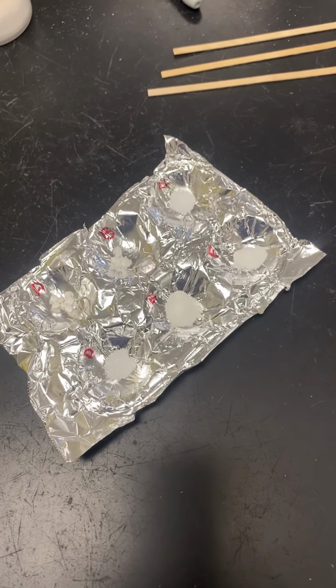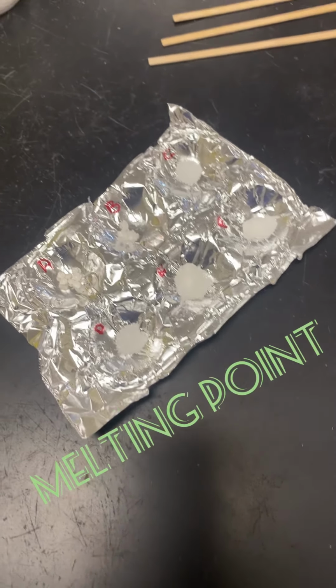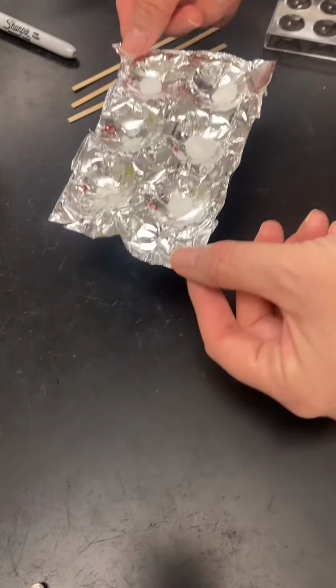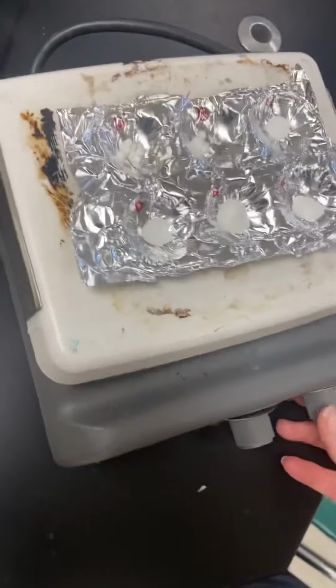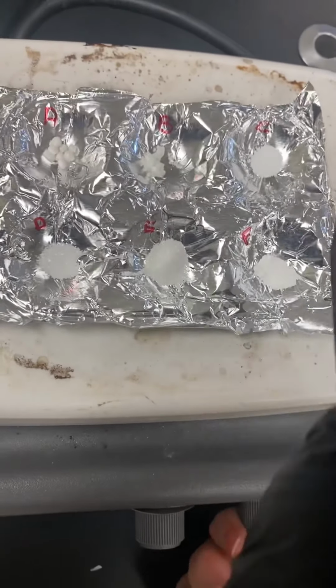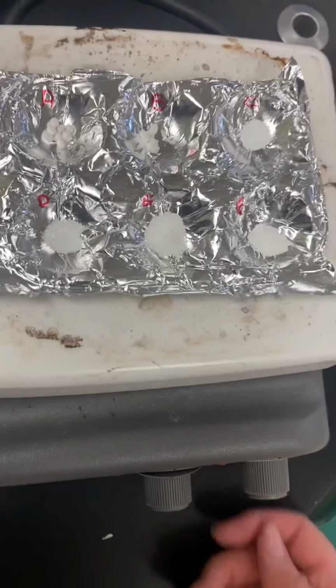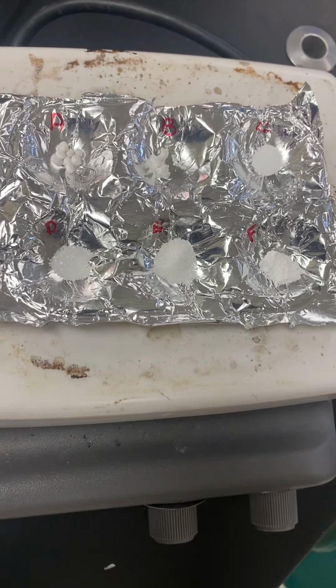So for the second column on your data table, you're going to be doing the melting point. We don't need to know the actual melting point of each one, but we're going to put them in order. So we're going to watch the samples. It's still set up in the same order. So A at the top left, B, C, D, E, and F. And we're just going to see which one melts first, second, third, and I think only three of them melt.